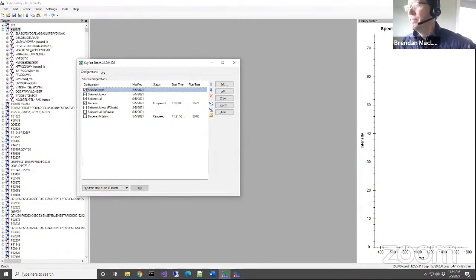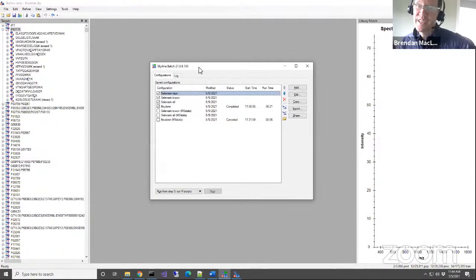But yeah, there's definitely ways that you can get more and more restrictive, and I think reduce your noise. Certainly, if you're taking some set of the most intense peptides for each protein, that's going to be higher signal to noise and likely to give you better quantitative results. One thing that Lindsay also did is she ran a whole different experiment where she was able to assess the linearity of response. And so she might kick out things that don't have a linear response or that have an LOQ, you know, so there are lots of ways that you can improve what you're doing quantitatively.